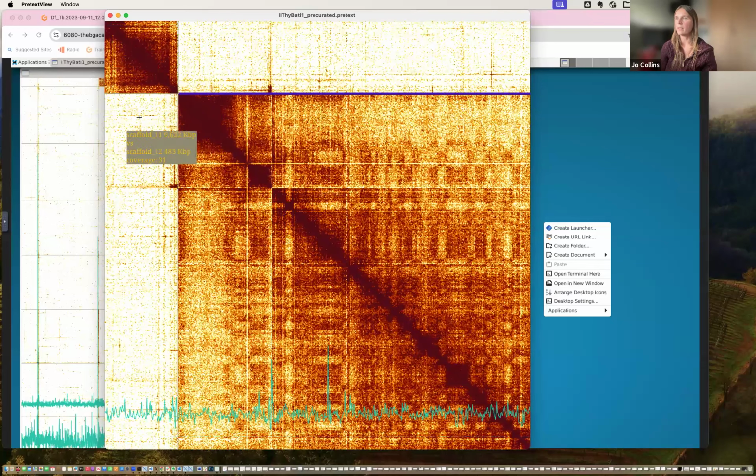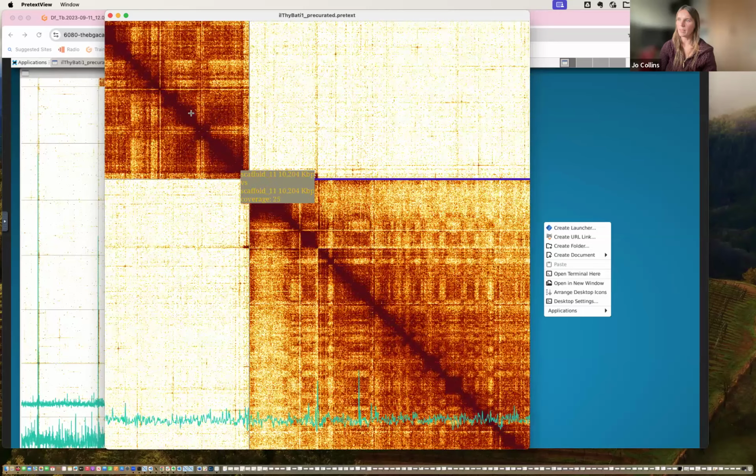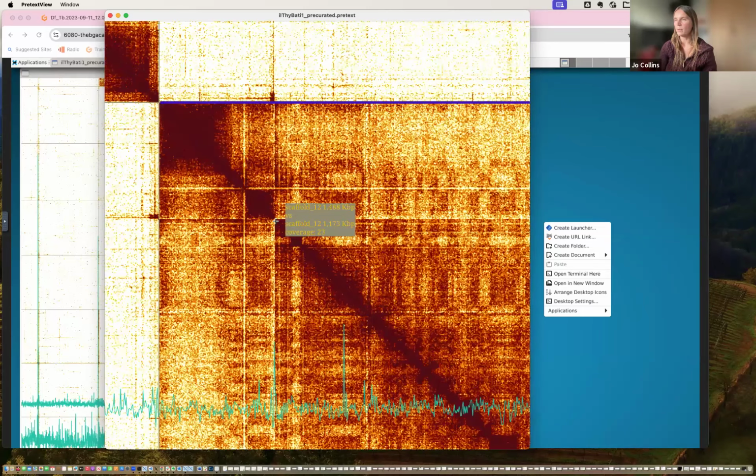And the other thing to note is, as I mentioned before, particularly in Lepidoptera, the telomeres that we see often light each other up. They often have affinity with each other. And we've got telomere on the end here, which we know we're happy with the assembly of this chromosome. And what we're seeing is actually that this telomere here has affinity with this region in this assembled scaffold.